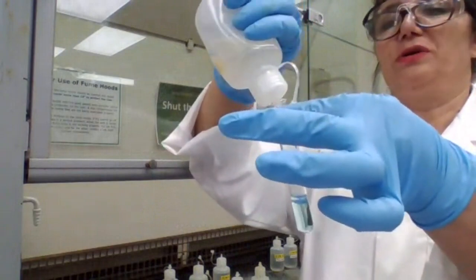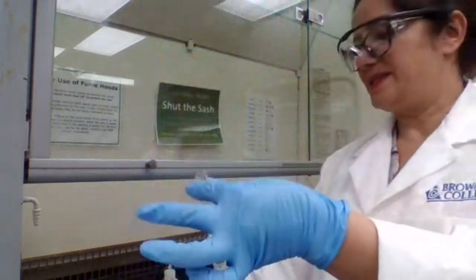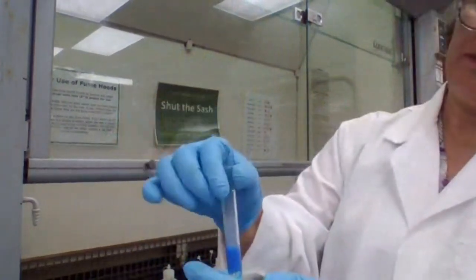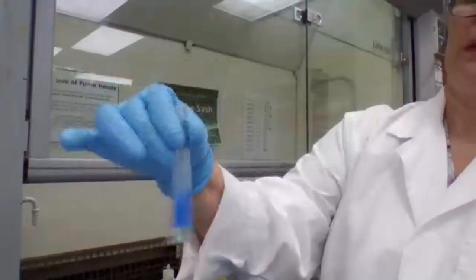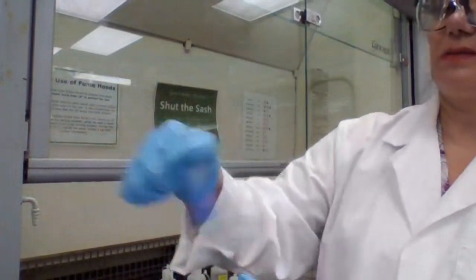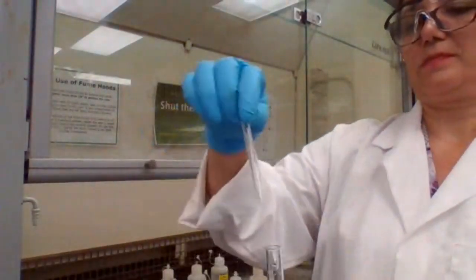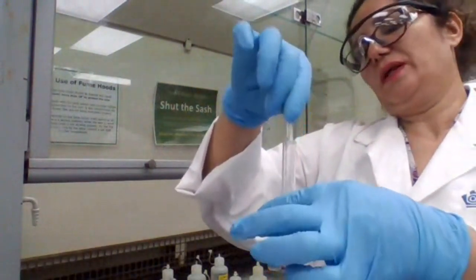So I have to add enough that the precipitate stays, or test the solution with litmus paper to make sure. Mix it well.